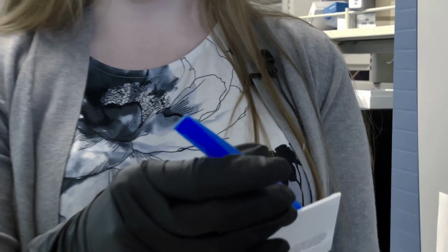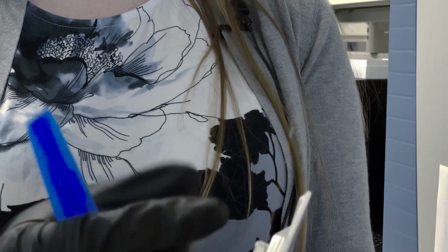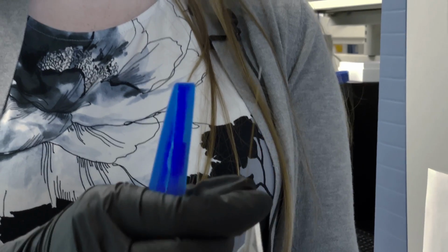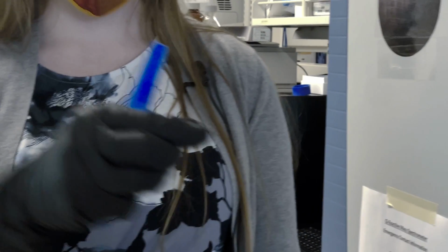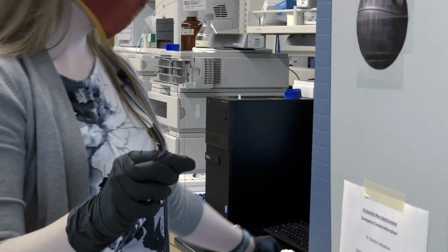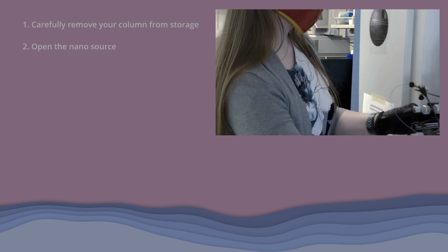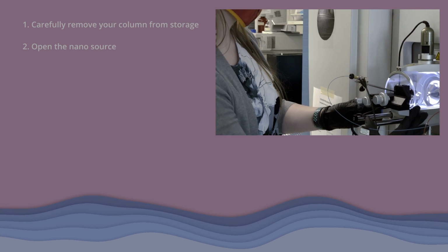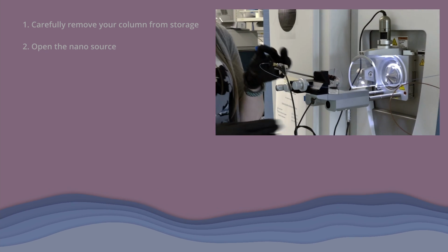As is the case with a lot of things we work with for nano LC, it's very fragile. Once you have it moved enough, you can start to pull on it with your fingers to remove the column from its case. Then you'll want to open the nano source to give you room to work with.